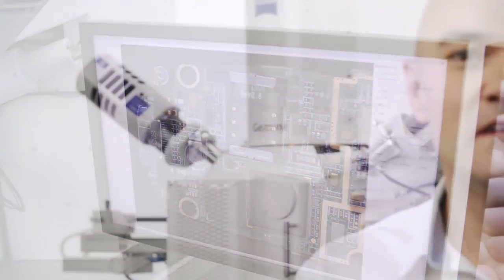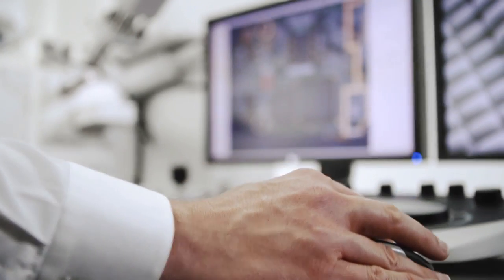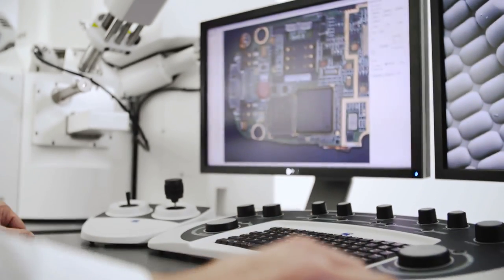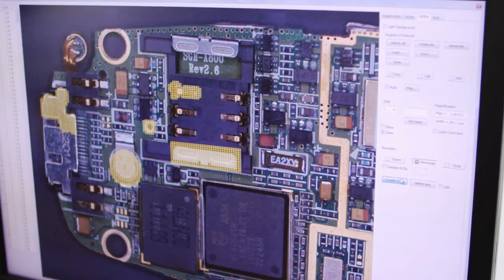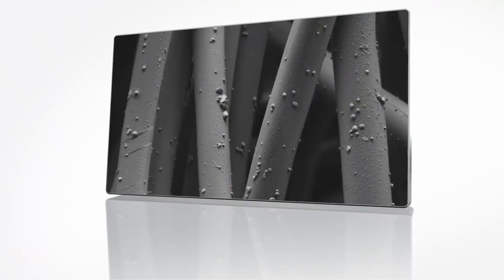When developing Sigma, we looked at the way you work and designed workflows to support your imaging and analysis routines. Now you can obtain your data faster than ever before.